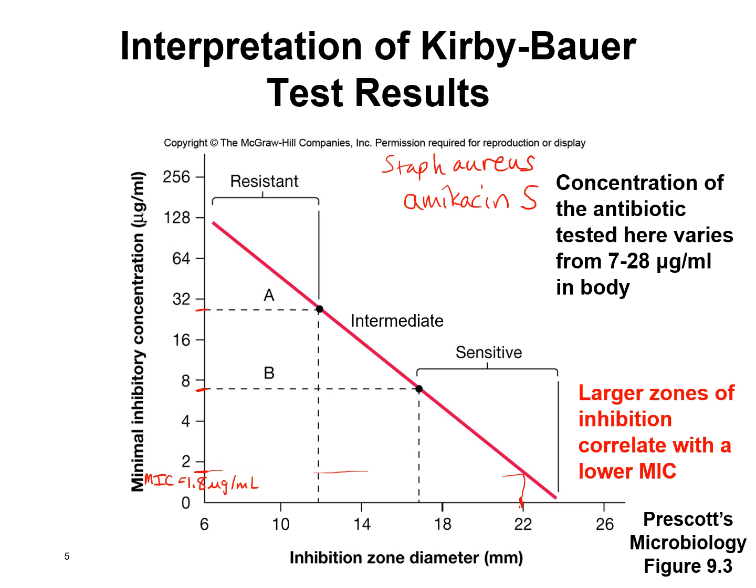But let's say that maybe we had another antibiotic that we were looking at. Maybe we had some penicillin. And maybe for this one, when we measured that zone of inhibition, let's say here's our antibiotic disc, and maybe our zone of inhibition here, when we measured that, was only 8 millimeters. Okay. And they actually have tables for this instead of a graph that you can just quickly look at to tell this, but you would have a different graph for each antibiotic.